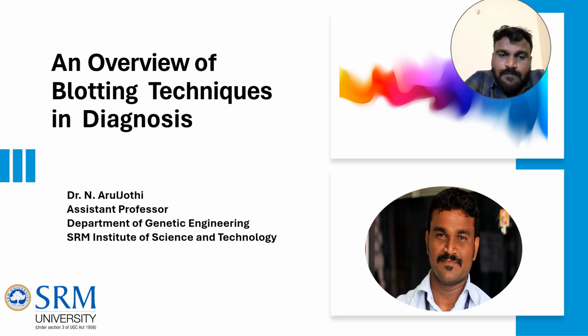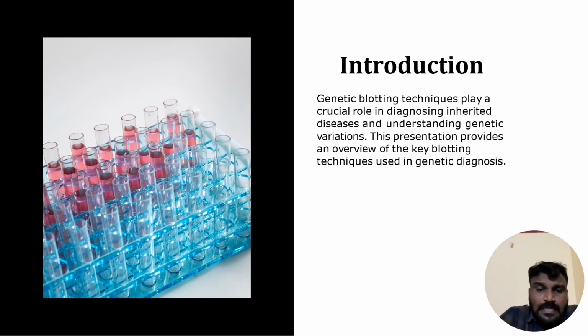This lecture will give an overview on Southern blotting, Northern blotting, and Western blotting, and how these techniques are used in genetic diagnosis. These blotting techniques play a crucial role in genetic diagnosis and also help us to understand the genetic variations, differential RNA expressions, and differential expression patterns of proteins. So we can use these techniques in genetic diagnosis effectively, and we'll see how we are doing it.